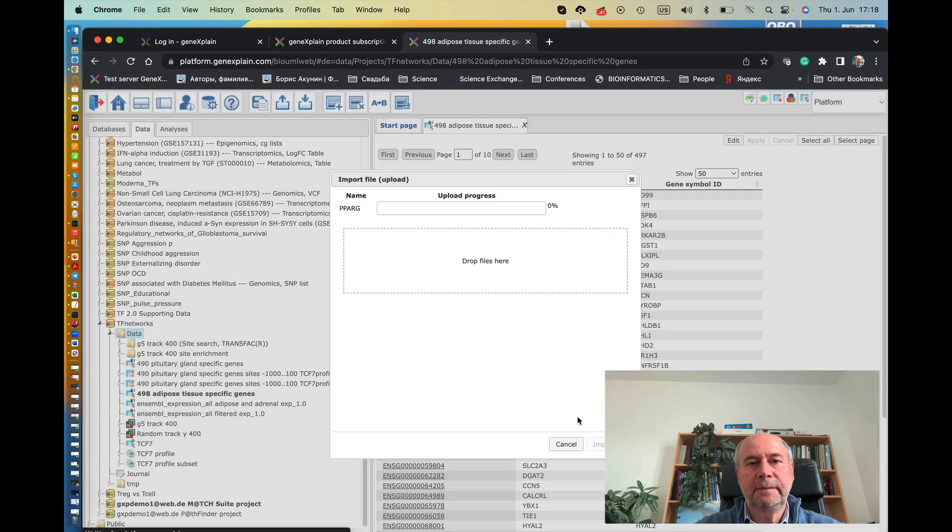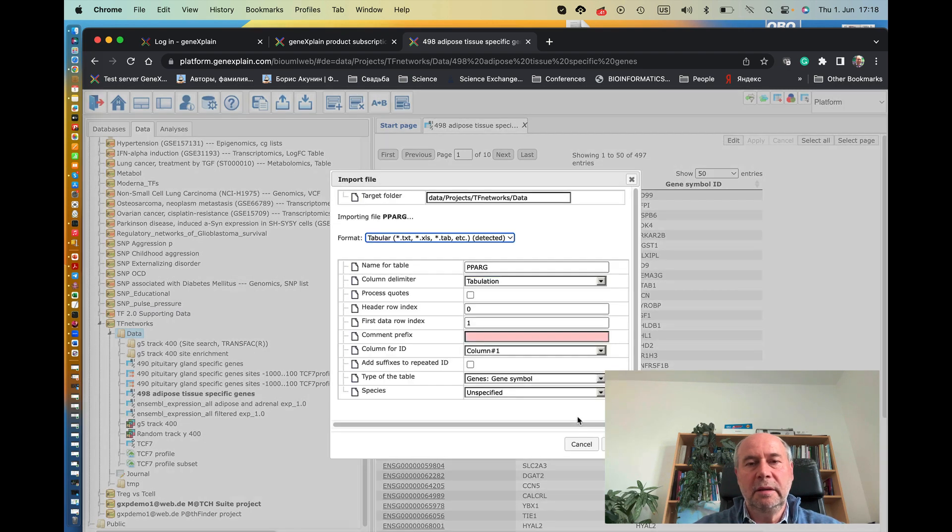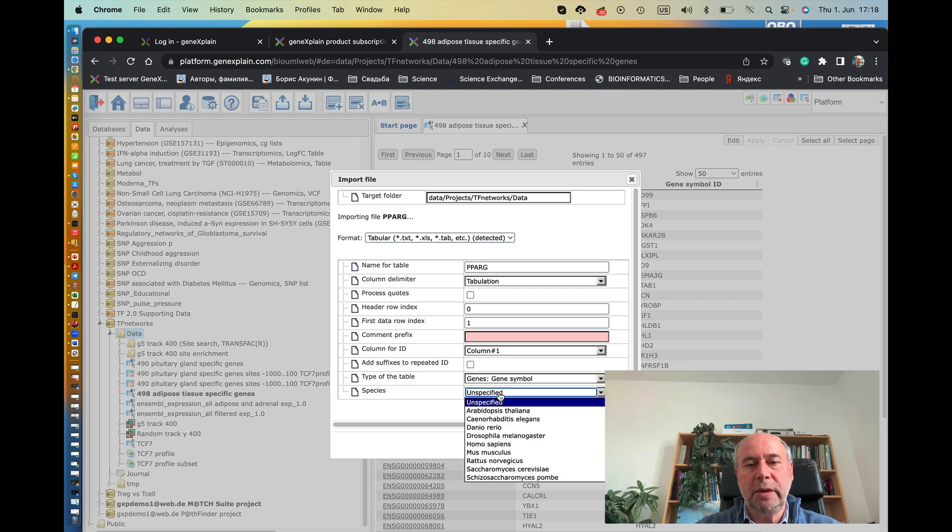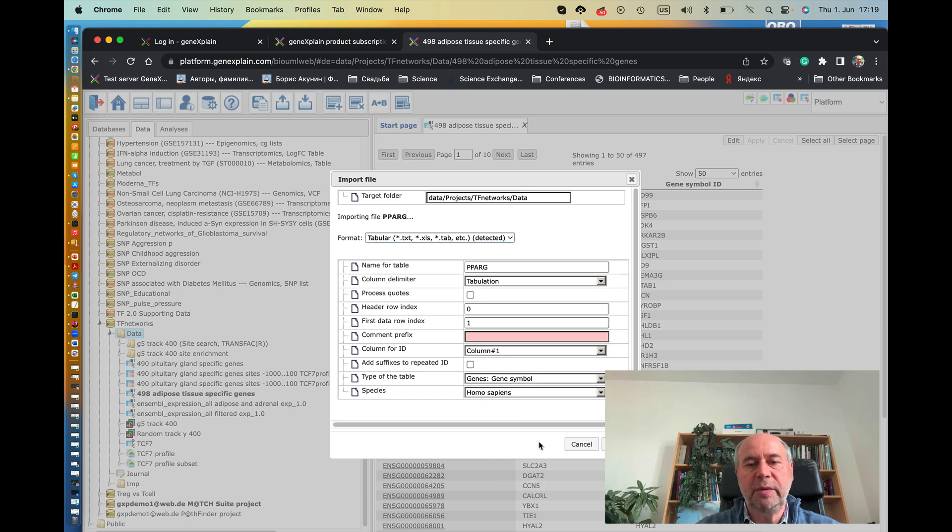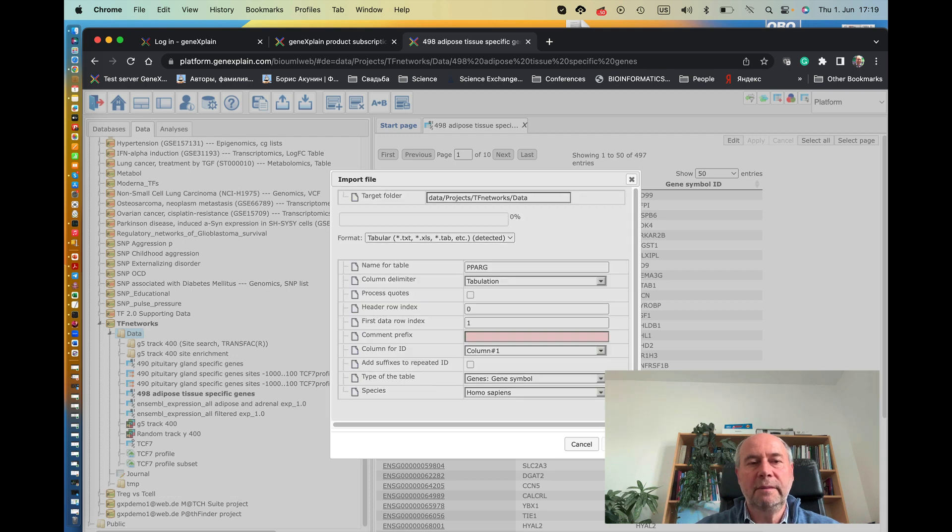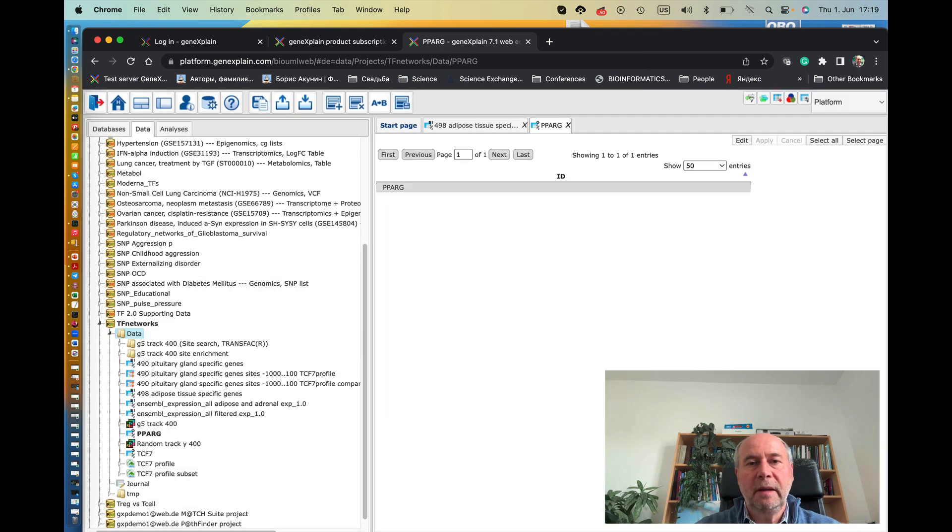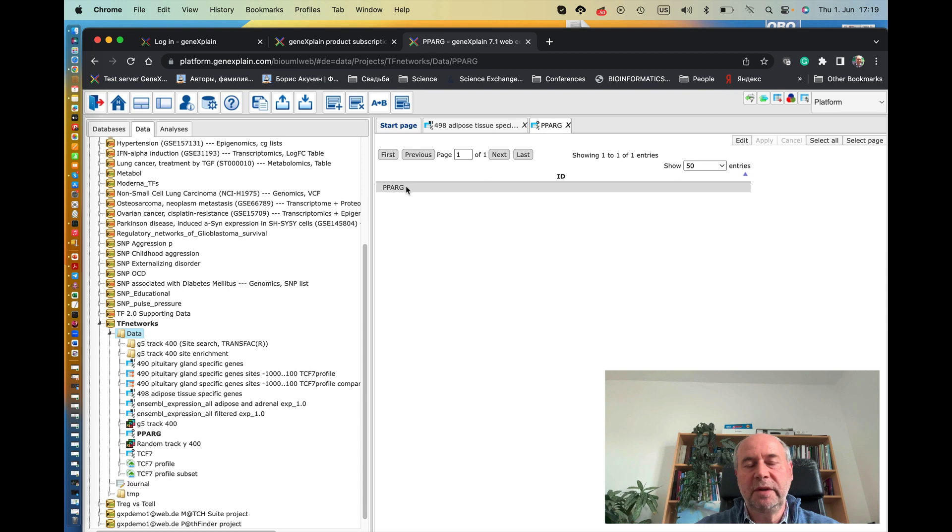So we click OK, and now it asks whether it's a gene symbol. We can also specify the species, homo sapiens. Now we click start, and here we have a file PPAR gamma which has this gene name PPAR gamma inside.